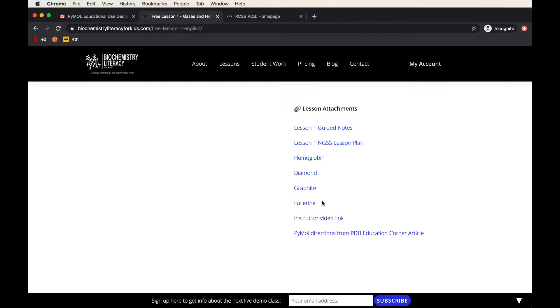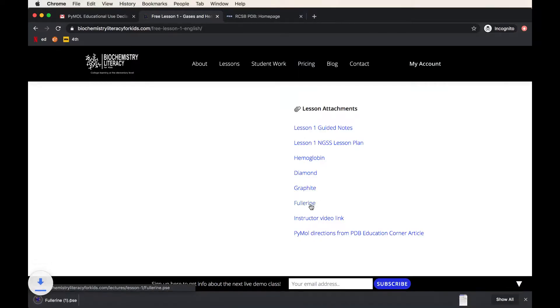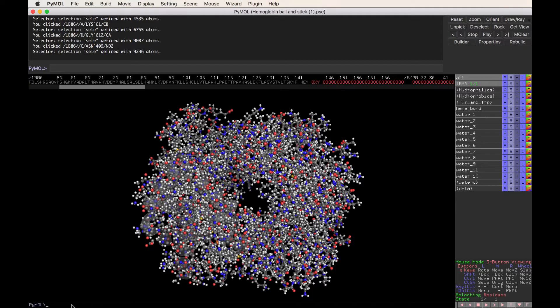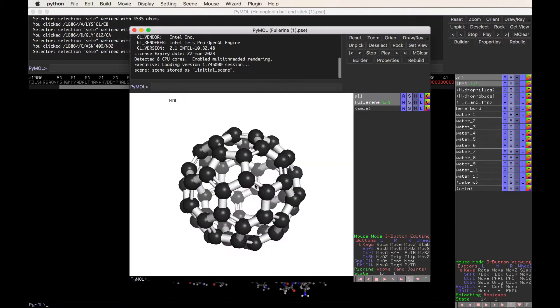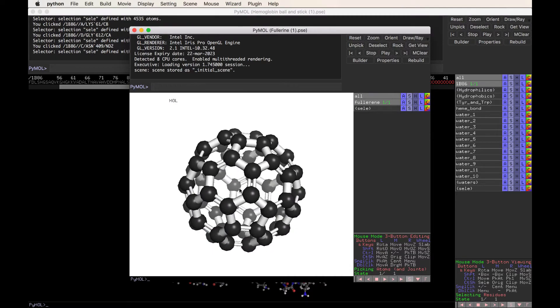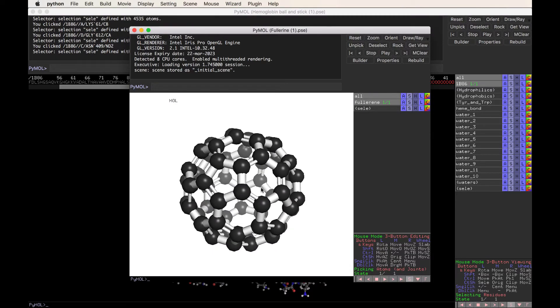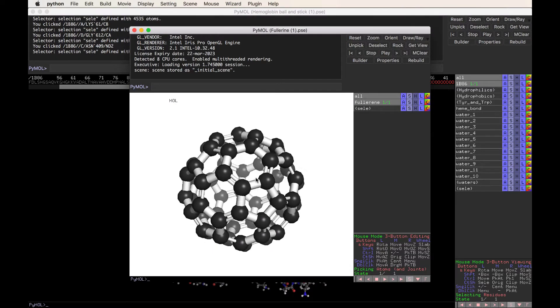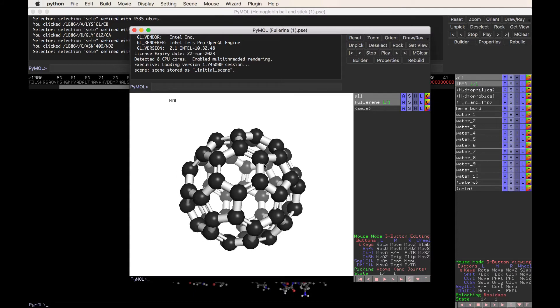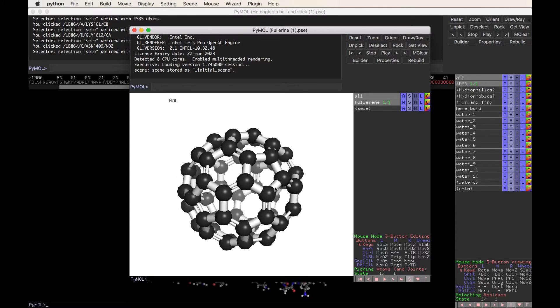And we also have the most fun form of carbon, which is the fullerene, also known as Buckminster Fullerene. This is a molecular soccer ball. It's made of 60 carbons arranged in the exact geometry as a soccer ball.